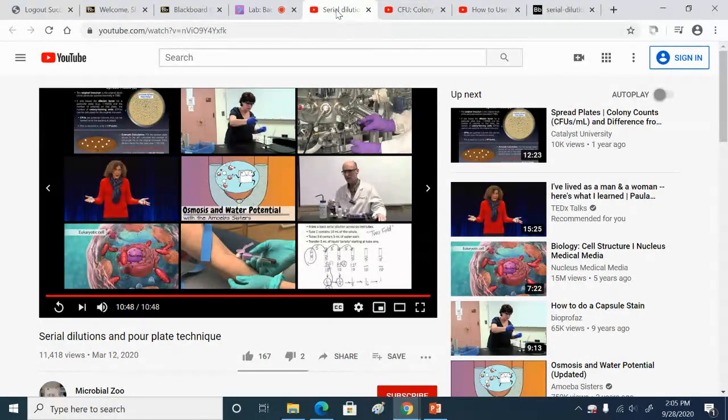So yeah, we have one more interesting video which shows you technique as well as explaining how to do the dilutions. And in this video, we're also going to see the pour plate technique. So instead of spreading your diluted sample on the surface of the agar plate, the diluted sample is added to a sterile empty petri dish, and then sterile agar is poured in to mix with the bacteria. So both techniques work. The spread plate's just easier to do in lab, and it's a bit easier to interpret.